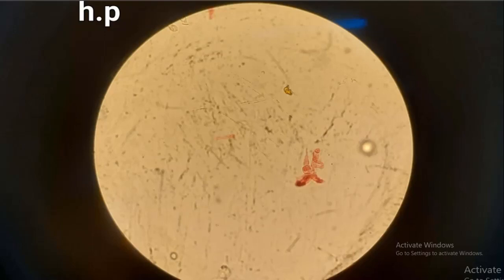Even in this slide, you can't easily appreciate the parts, but one important thing is that you can see some blood vessels in it, and you need to be able to identify it.